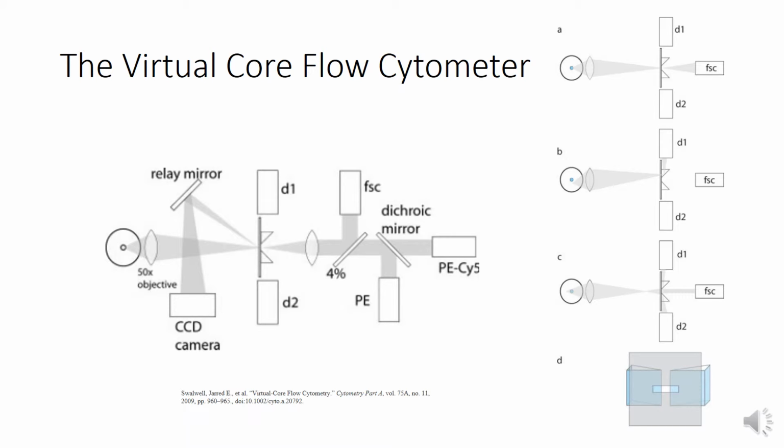In B, however, you see that it's slightly offset so that it only hits the mirror and bounces the light to the orthogonal detector, showing that it won't actually pick up any of the particles in the center, if there are any.